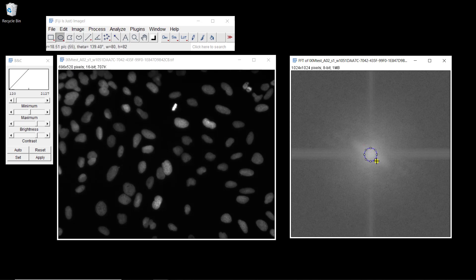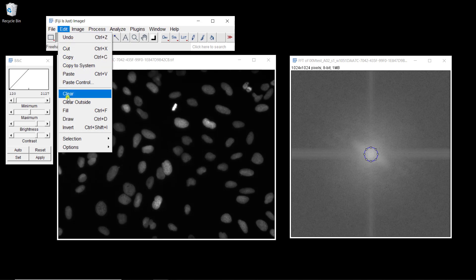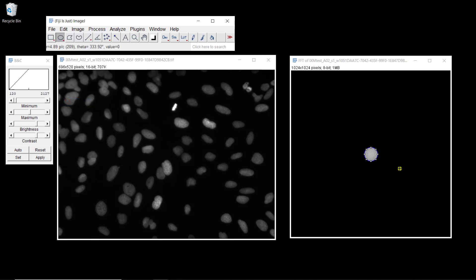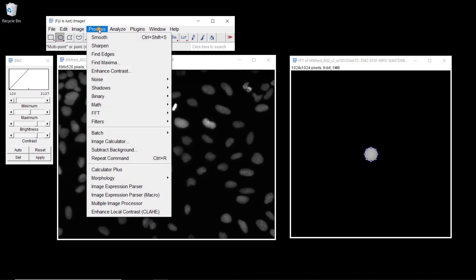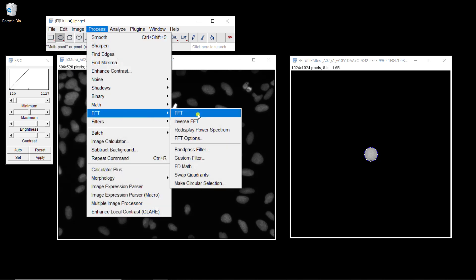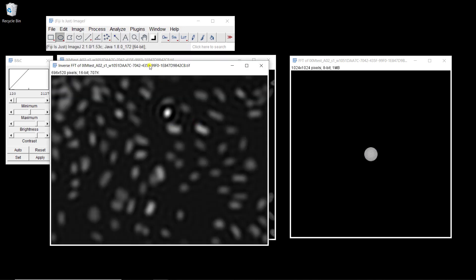This region in the center basically corresponds to the low frequencies of your image. If we want to see what this corresponds to, we get rid of everything else — go to Edit and do Clear Outside. Now we only have the low frequencies, and we can actually do an Inverse FFT on that. So we go to FFT, Inverse FFT, and this is what you get.